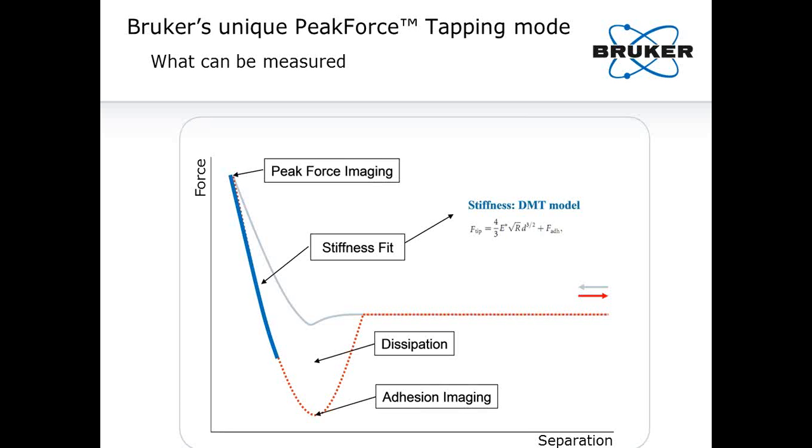Going further, the force becomes repulsive, as the cantilever is touching the surface. When a set maximum force, the peak force, is reached, the cantilever starts retracting from the surface. In the example above, the repulsive curves into and out of the surface are different, indicating a plastic or viscoelastic component. When moving beyond the initial point of contact, the force becomes negative until the cantilever breaks free from the surface. This component represents the tip sample adhesion. The area enclosed in the curve is the energy that was dissipated during the interaction.